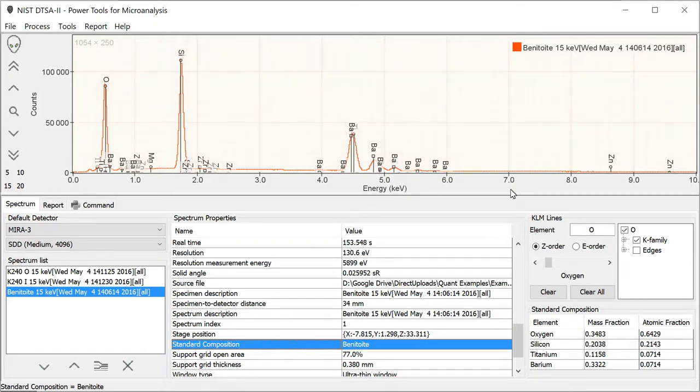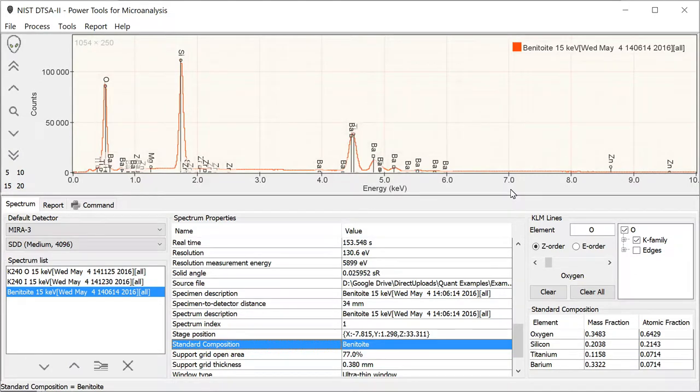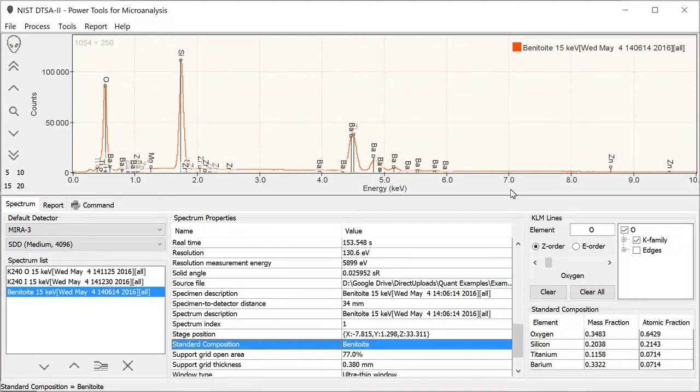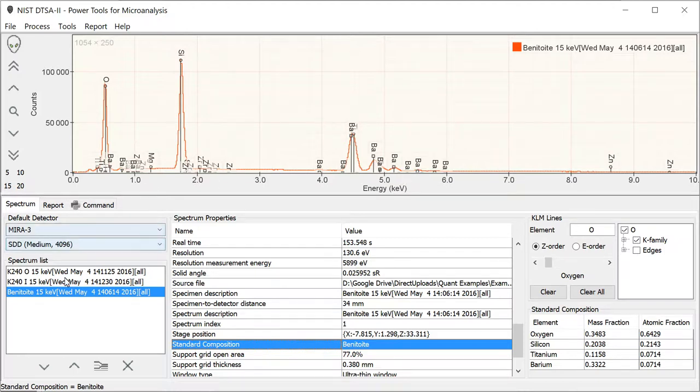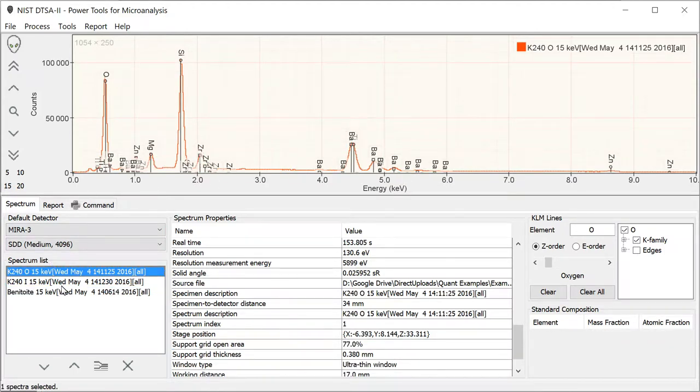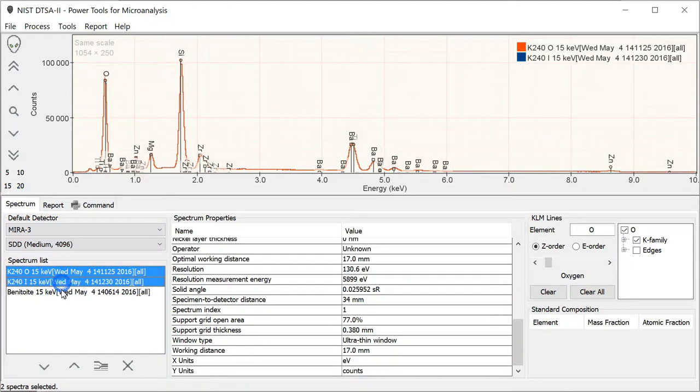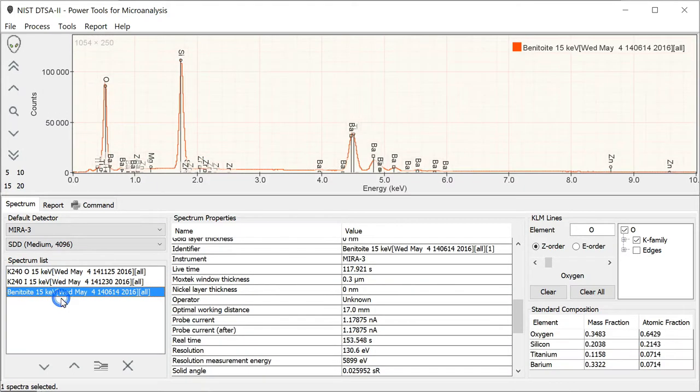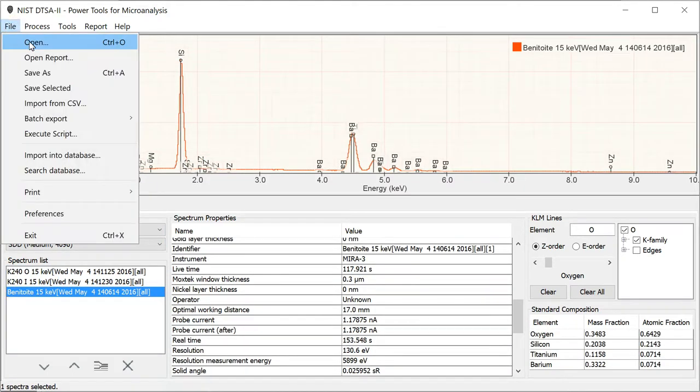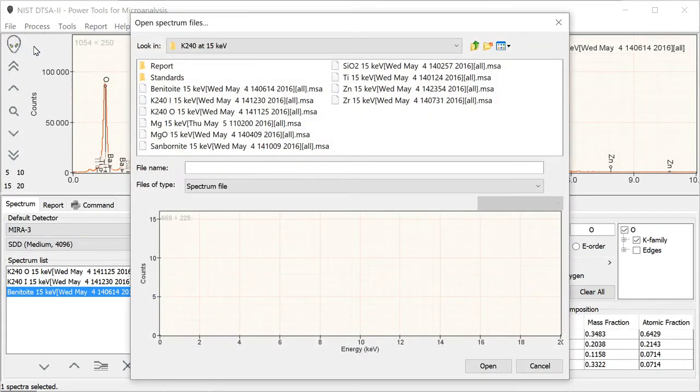Now we understand how the information about the spectrum is stored in the spectrum data file and how you can go about editing it. We're now really ready to go ahead and quantify this spectrum, the K240 glass. To do that, we're going to need to provide a number of standards. We're going to use this Benitoite as one of the standards.